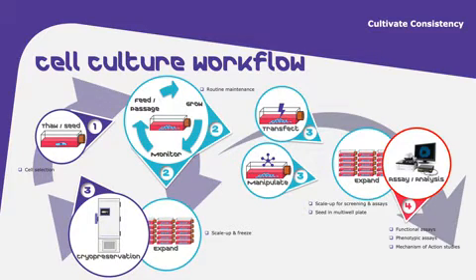You may want to manipulate cells by adding potential therapeutic drugs and measure their effect on the cells by running an assay. Cells may be transfected with a gene of interest or undergo any other manipulation. All will later be used for analysis, depending on the goal of the study. Also, if you go back a little to step 2, you may want to cryopreserve your cells so that you can have a frozen stock for later use.